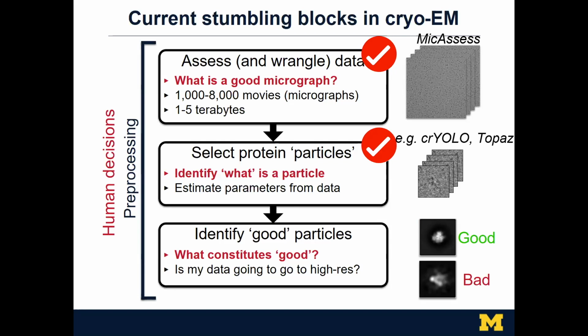They have generic models so that you can just pick by the generic model without any manual picking. For the pipeline that I will show in a later slide, we use Cryolo because I think they have a better generic model, and it's also pretty agnostic to the particle size, so the picking box size.